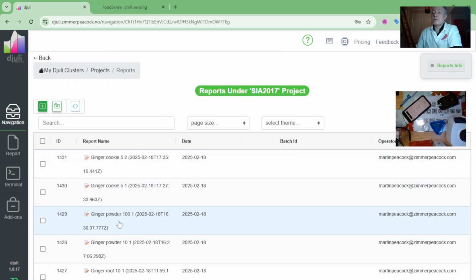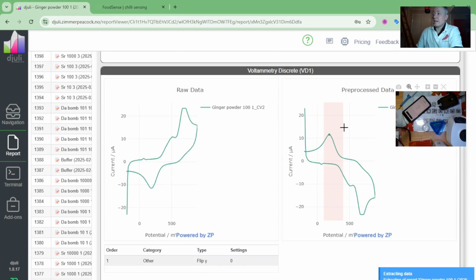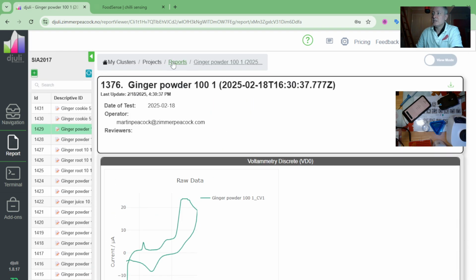I'll give you a sense of this. This is the ginger powder that I did earlier on, with a 1 in 100 dilution, mind you. Not 1 in 5, but 1 in 100. Let's have a quick look at that data. That's a peak, right? That's what a ginger powder looks like, and that's 10x what we're talking about here at the moment.